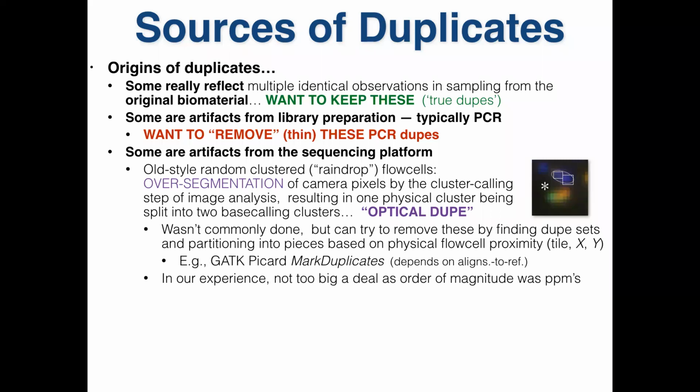PF0s, in terms of empty wells, didn't exist because empty areas of flow cells weren't called by the base image analysis as a thing. If the spot is just black for the whole experiment, you don't bother to even track those pixels. But one of the first steps of image analysis in that world is to decide which pixels belong together and to separate groups of pixels into different spots. And in that case, everything was a something. There was no empty space that wasn't even recorded.